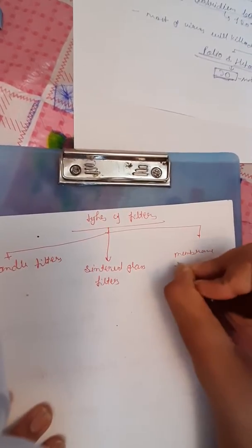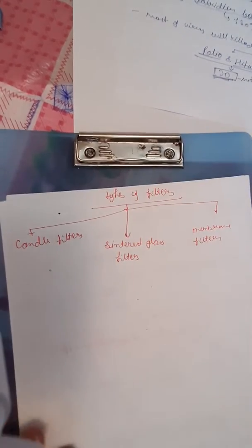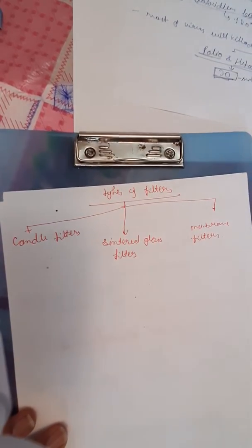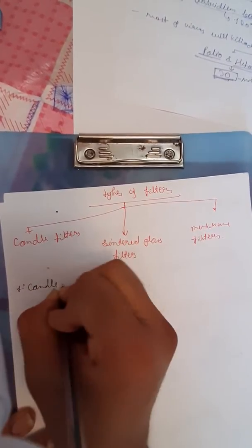One by one I will describe here. First we will see candle filters.